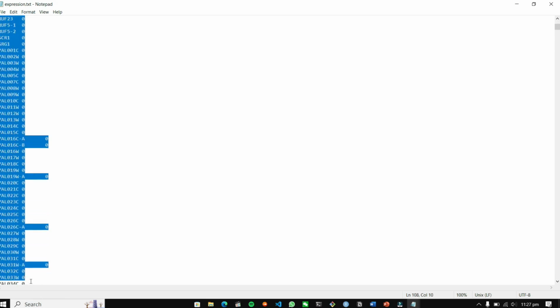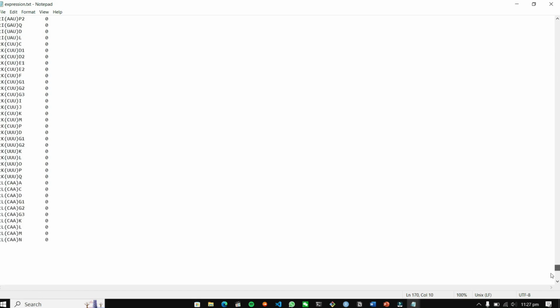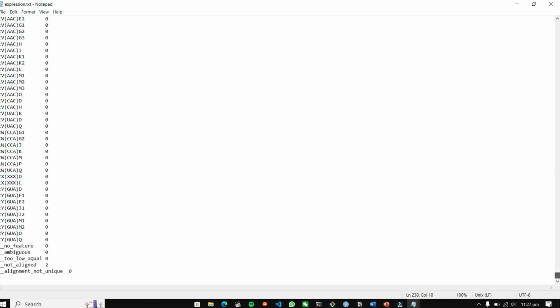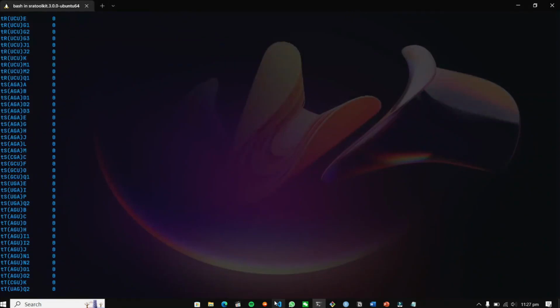You should know what the FPKM value is for this lecture, because in the previous session I told you about it. So here is the number of genes that are analyzed. There were no features found because we are only using two reads. If we had used a file of around 400 megabytes, there would be a lot of features. Just for the demo, I used only two reads.